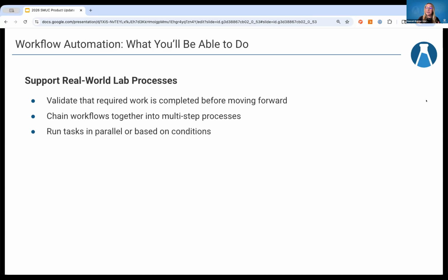And this is, again, as part of the last several months of conversations that I've had with customers, something that comes up again and again. And so the ability to ensure that we dictated work to someone and that then that work was executed in the way we expected, or when it wasn't executed in the way that we expected, we're able to capture those deviations. So that's something that I'm very interested in continuing to build out and learn directly from you as a customer.